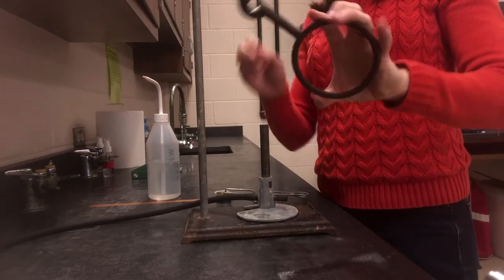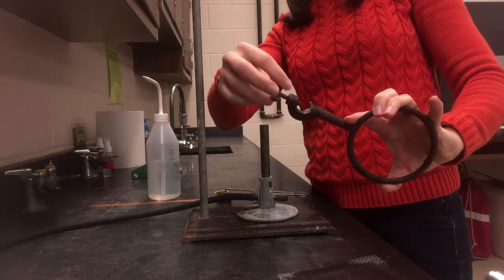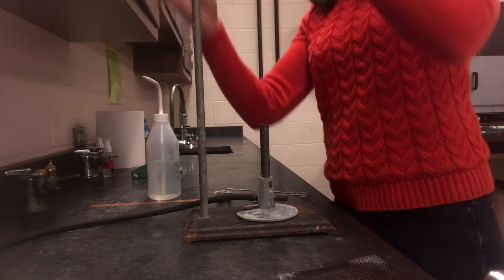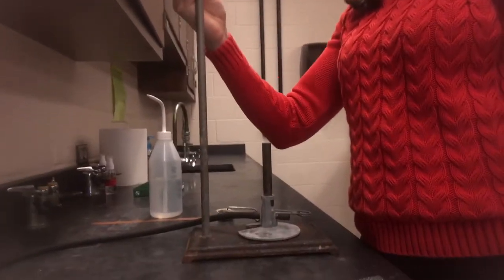Then you'll take your metal ring, and these have a screw clamp at the back. Make sure it's open enough to go over the top and slide over the top. Slide it over the top of the ring stand and slide it down.